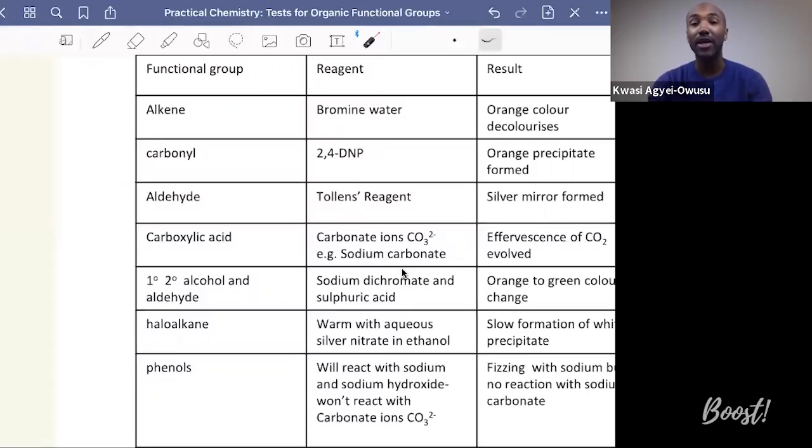We'll also look at the halogenoalkane functionality, so where the halogen is chlorine, bromine, or iodine. We'll look at how you can show that these halogen atoms and the halides that are formed as a result of hydrolysis are present using silver nitrate. And we'll look at how to distinguish between the different halide products formed.